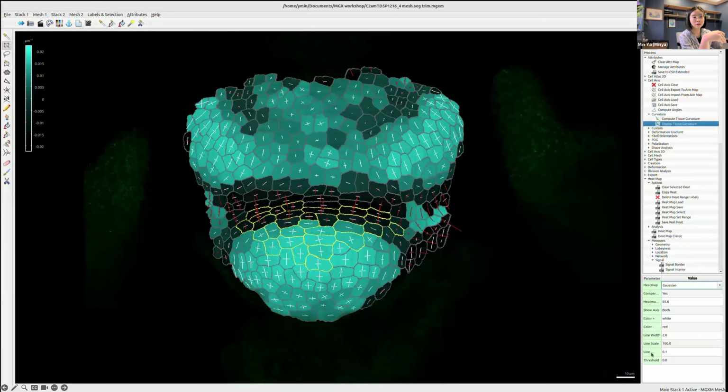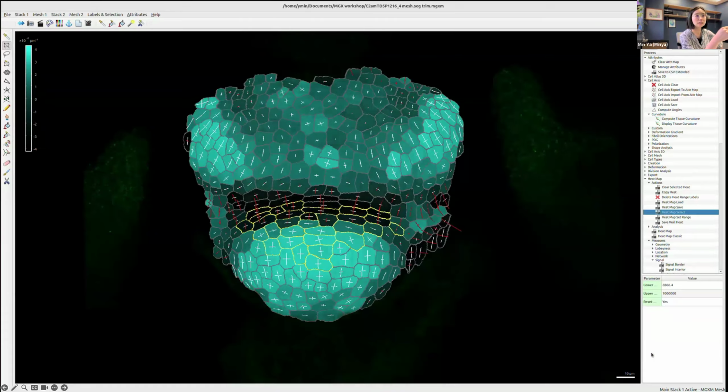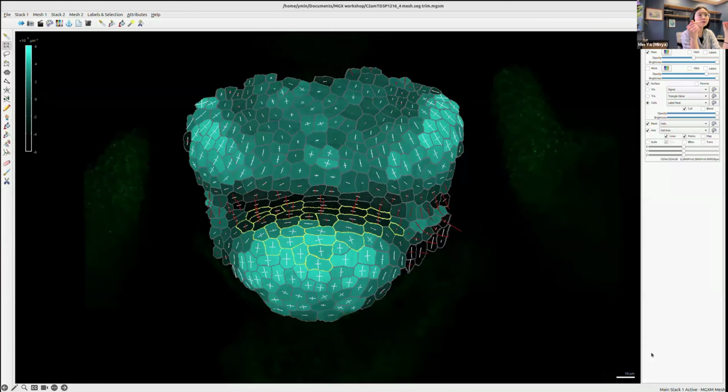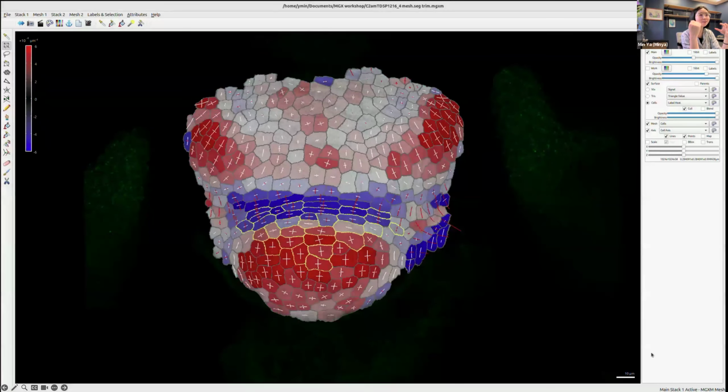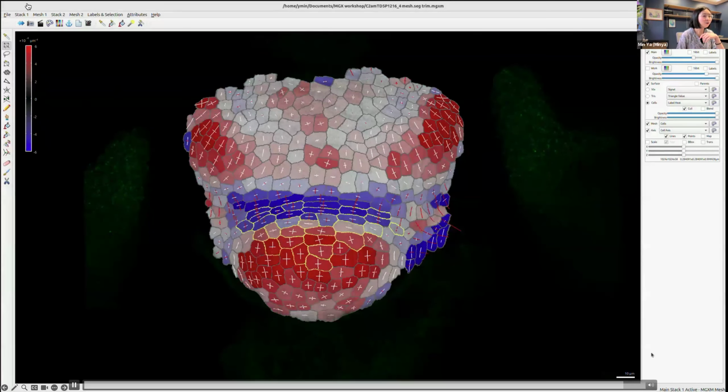And there are different types of curvature, and I have been using Gaussian surface curvature consistently. And for all the curvature maps in the study, they have the same heat map scale as well. So now I'm setting that scale, and then finally we change the appearance of the heat map. And done. Okay, so I know I ran through everything really, really quick.